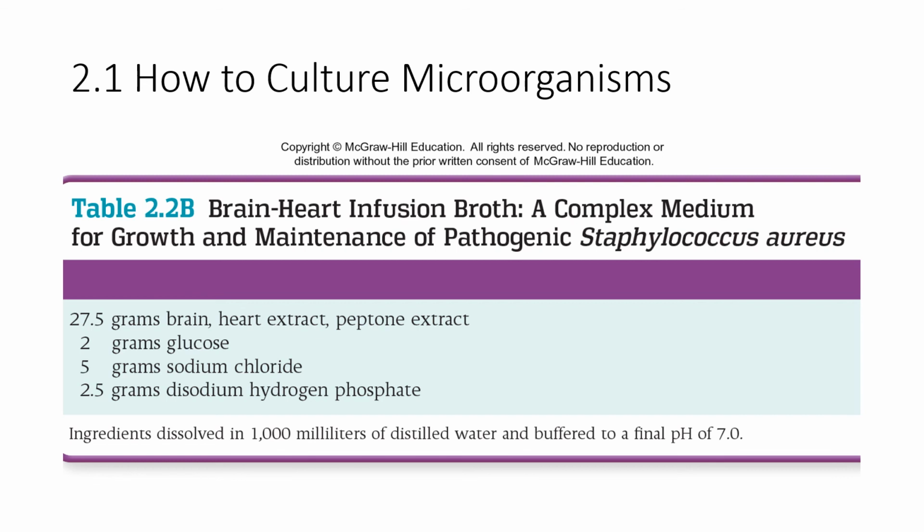We just know there's going to be lipids. There's going to be amino acids. There's going to be some sugars. How much? Don't know. But this is a soup. When you look at this, it is literally a soup, a broth, an agar that is so nutrient rich, this brain heart infusion broth, that you could live on it. You as a human being could actually eat this as your dietary source of calories.